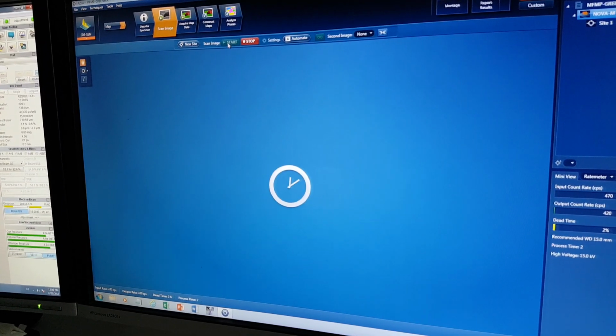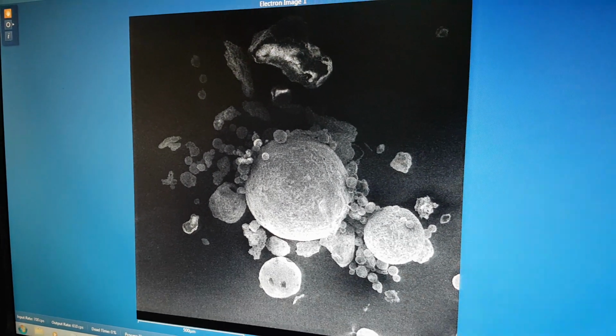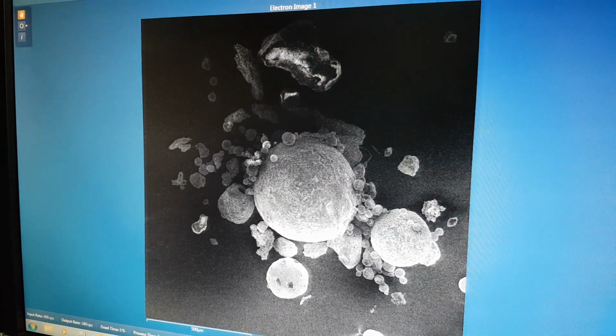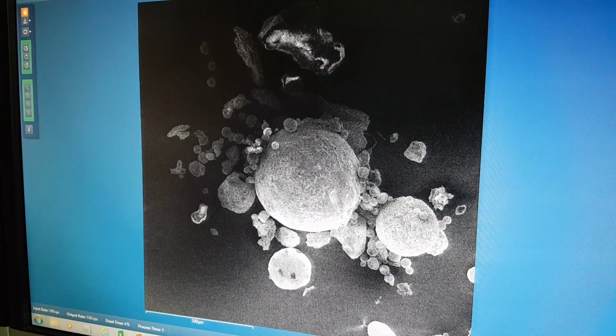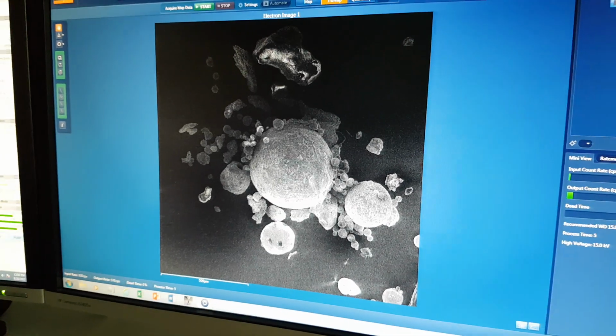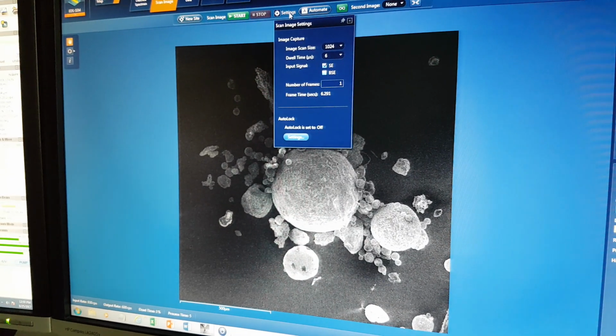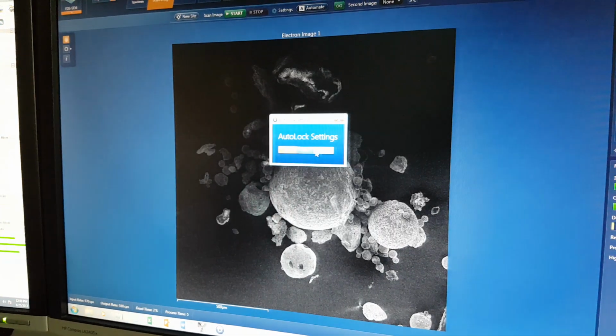So we're just about to do a map or whatever that is. So the alignment's a little out, but it's showing a bigger area. Let's see what it sees.